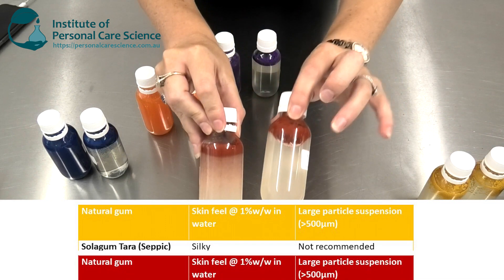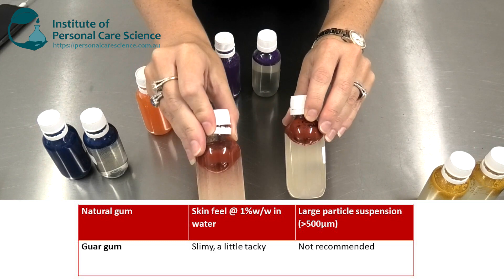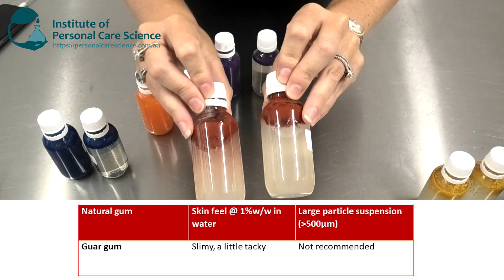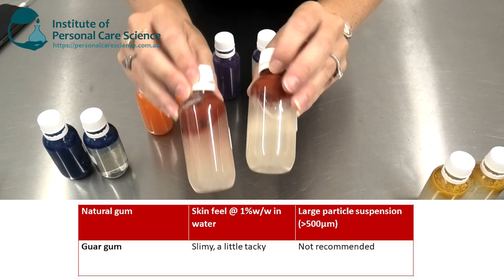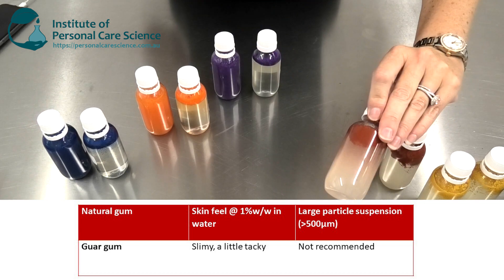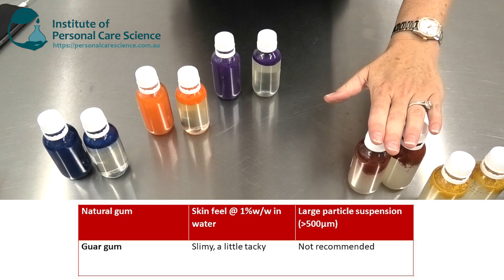Next is Guar Gum. At 0.5% and at 1%, you can see both aren't great at stabilizing particles. In terms of skin feel, it does actually feel a little slimy, so it will be best used in wash-off products, but not for particle suspension — as you can see, it's not great at suspending large particles.